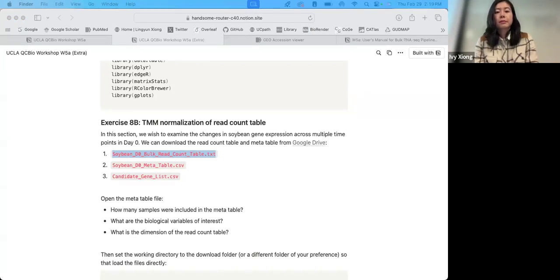One issue, just installing packages. For RStudio, if you have not installed all of the packages, we'll have to do that first. I think it's downloading now, right? It didn't finish, and there are all of these errors.